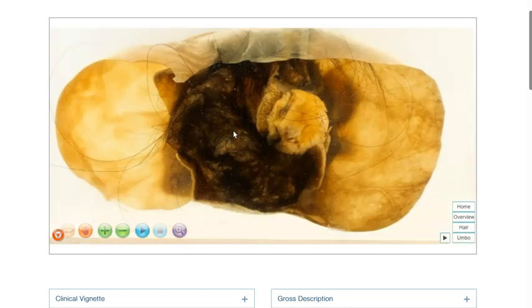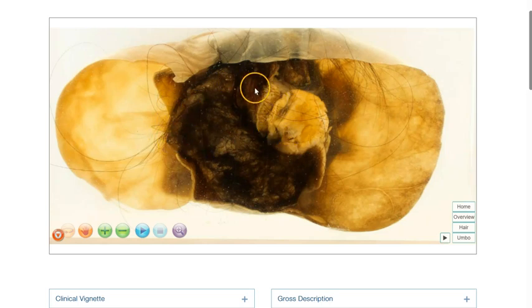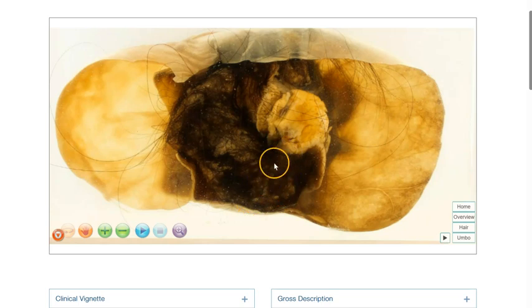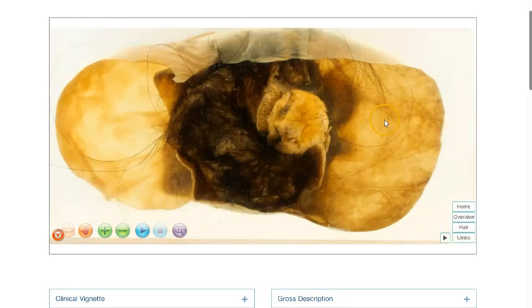So we can see that within this cyst locule, we have the solid area or the umbo, and we have lots of hairs coming out from the lining of this locule. The other locules appear to be relatively thin-walled without solid areas.